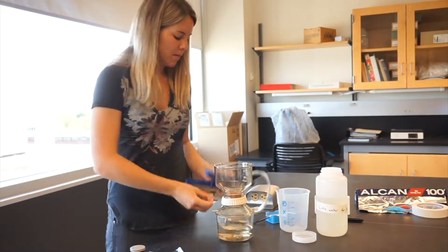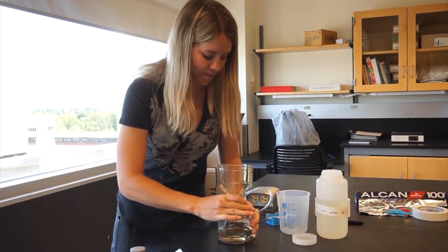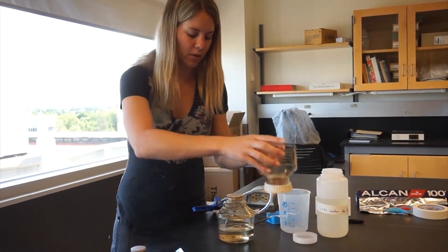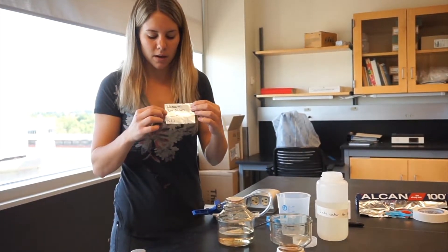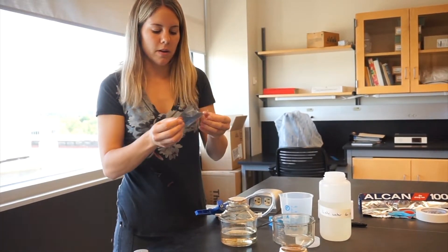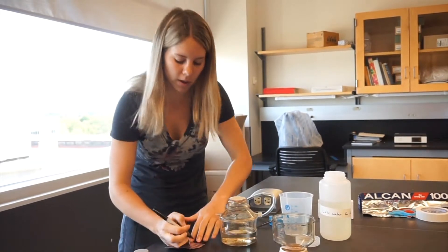Then detach the side filter and unscrew the top piece. You should have a tin foil square that you've cut, labelled with the lake, the date, blank milliliters, and CHL for chlorophyll. Since I filtered 250 milliliters through, I'm going to write 250 milliliters on here.